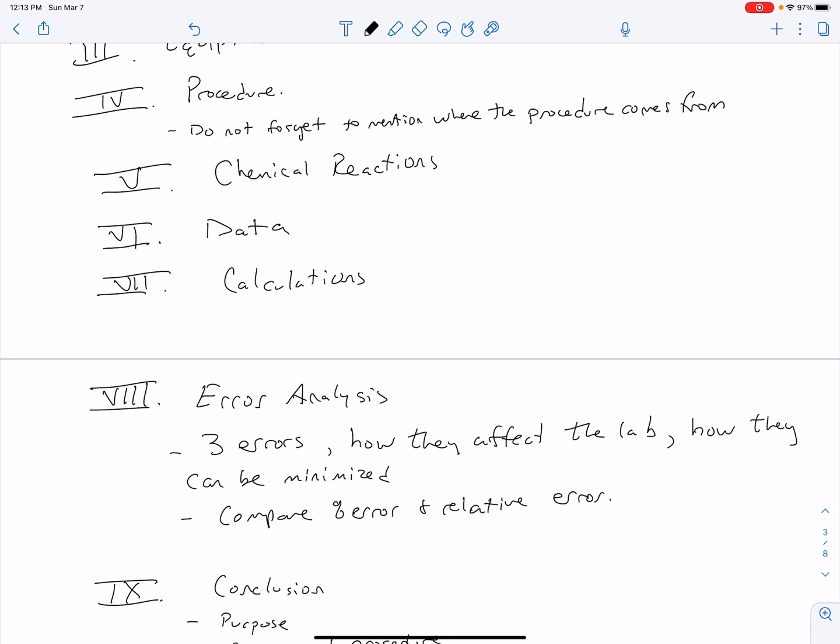Did you add too much or not enough of the sodium thiosulfate? Well, the amount of thiosulfate will determine your amount of bleach, because if your percent of bleach is very, very high, then you will need more thiosulfate to react. So high results would generally be things from an over titration. So more of the liquid came out. You passed the equivalence point. You had a drop on the side that didn't reach the inside. That you didn't fill the tip of the burette.